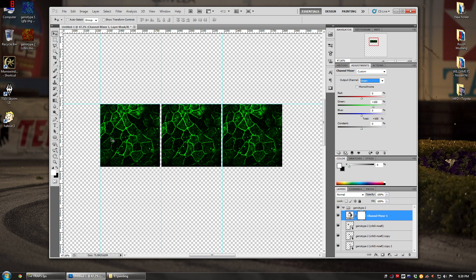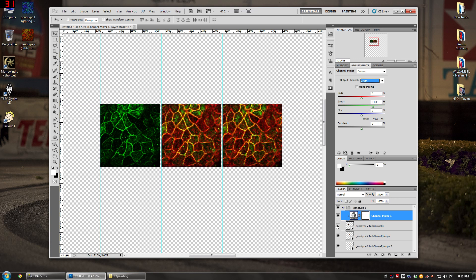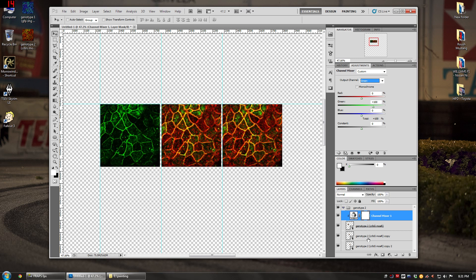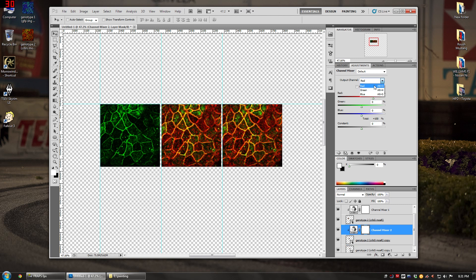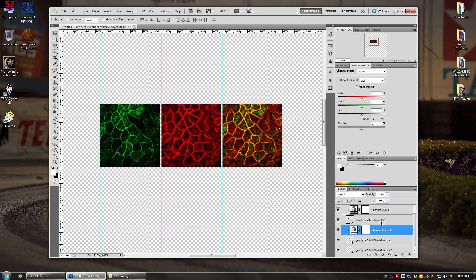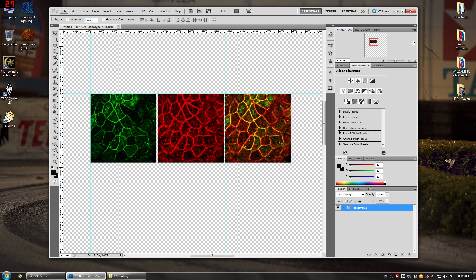The channel mixer adjustment was being applied to all three panels, but we only want it on the first one. To clip it, hold Alt and hover your mouse between the two layers — the cursor changes to two circles — then click to set a clipping mask. Now the adjustment only affects that one layer. Do the same for the second image: apply Channel Mixer, clip it, turn off green and blue to isolate red.